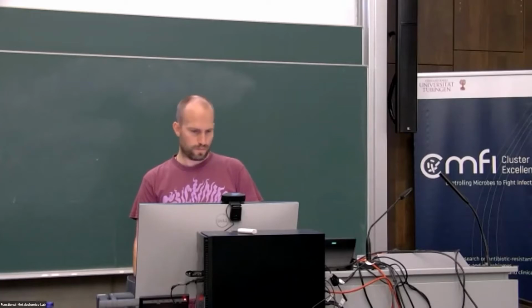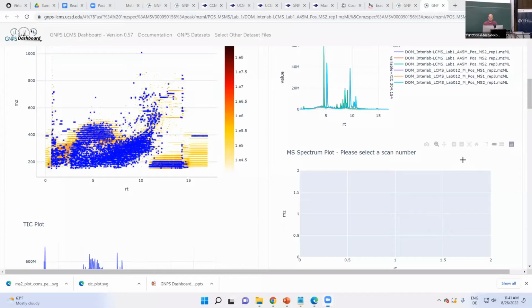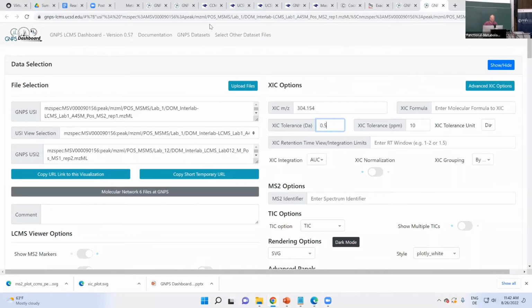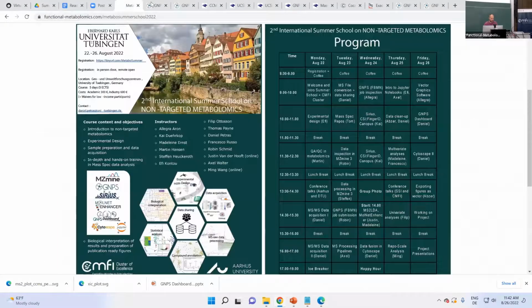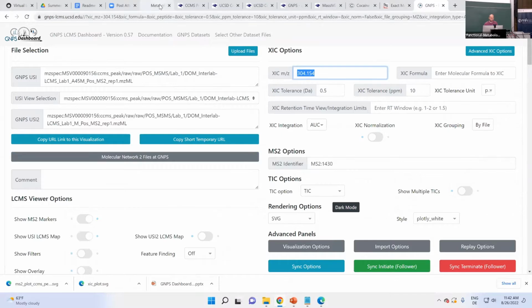Okay. Cool. Say what? Oh. Oh, okay. That was not what I wanted. Okay, I'm just gonna close this because I'm getting confused.